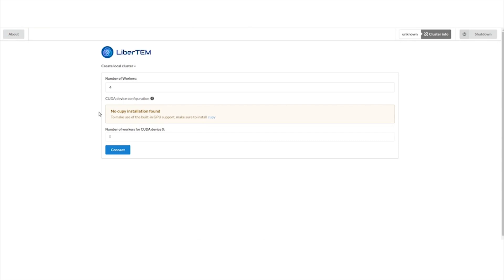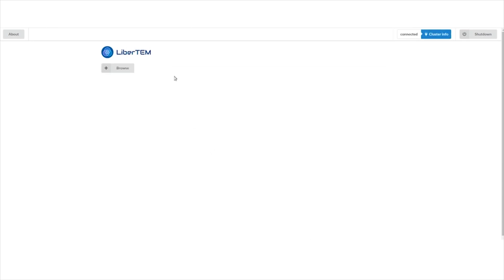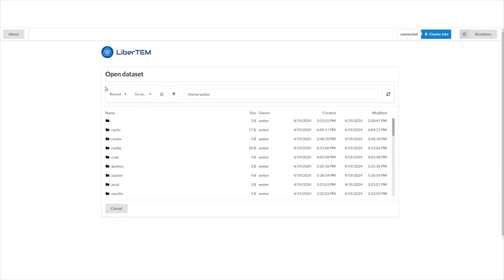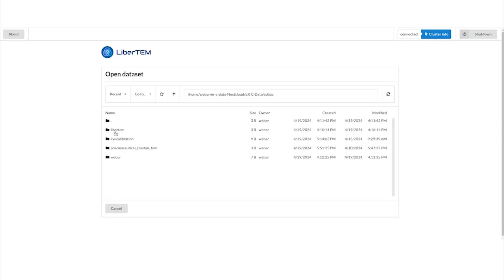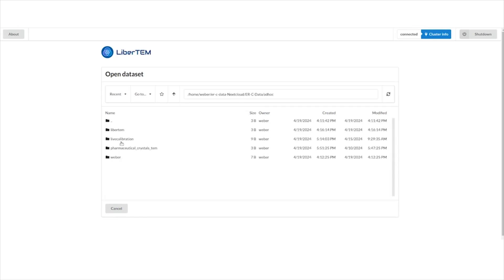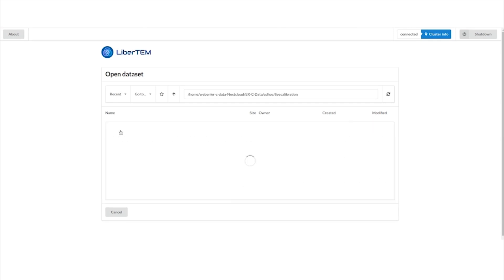LiberTem has GPU support, which I didn't install here. For file inspection generally it's not very useful — it's more for computationally intensive applications. For simple file inspection it runs fine on the CPU. Now we start in the background a Dask cluster that we use for offline processing as the execution engine. I've already downloaded some files. I used the Nextcloud from our data management system. Since we want to do live calibration later, I downloaded some datasets that Thermo Fisher sent me.